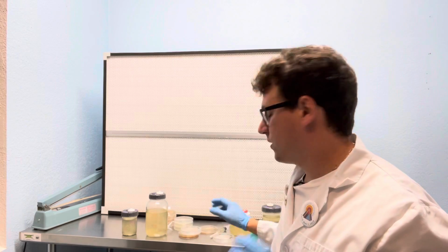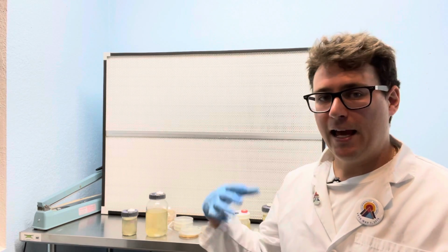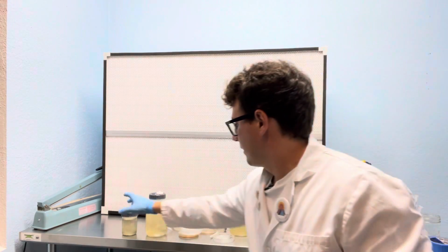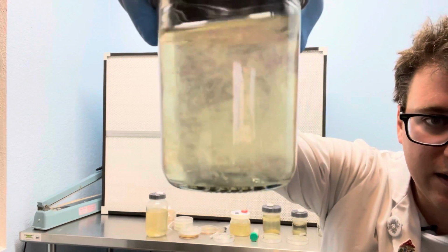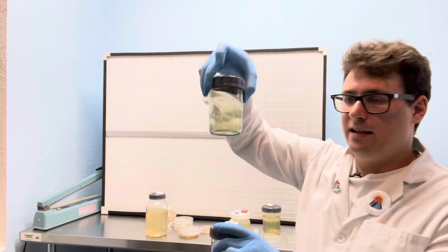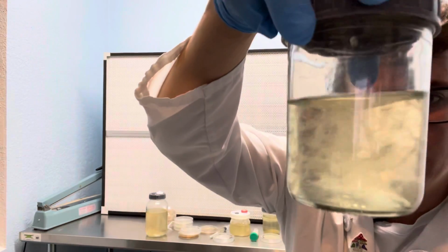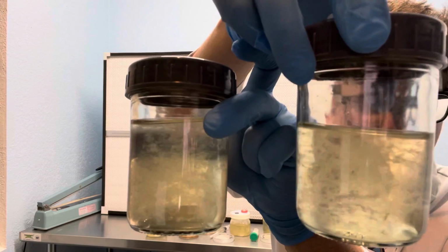I like to use the agar for quality control, because one of the problems when you're using a liquid culture is that you can't tell the difference between a contaminated culture and a healthy culture. This is a maitake, very healthy, you can see clearly through it. And then this is a contaminated oyster mushroom culture. You can see they both kind of look healthy.